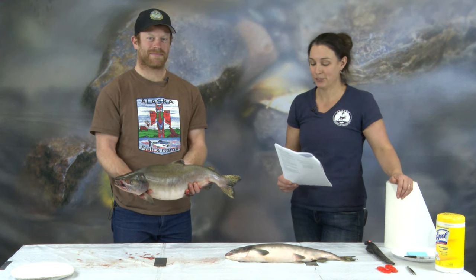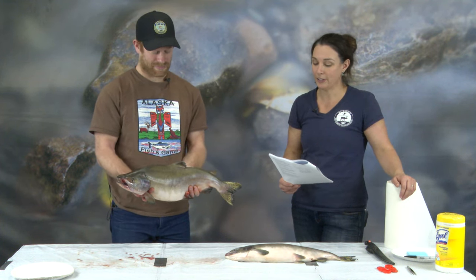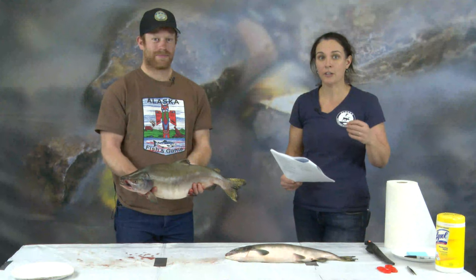As we go through this dissection today, I'm going to ask Andrew questions here and there. So first off, Andrew, I want to know what's the first thing you notice when you picked up this fish? It's slippery and slimy. That's because salmon have a slime layer on them. This slime is really important. It helps to keep predators away. It helps them slide easier through the water. It also helps to protect them from disease and fungus.